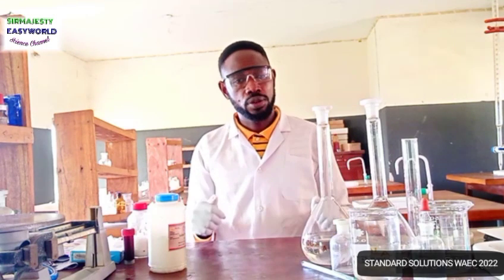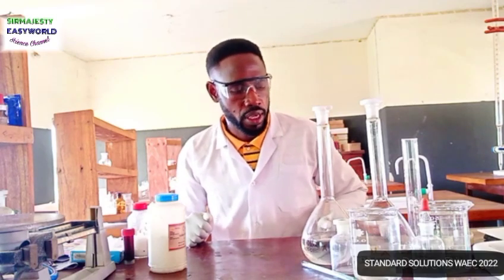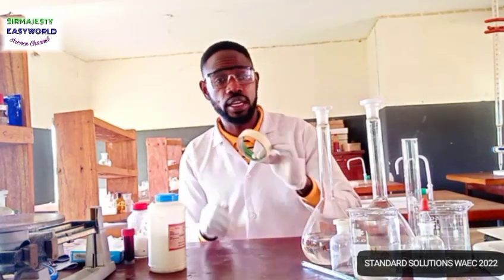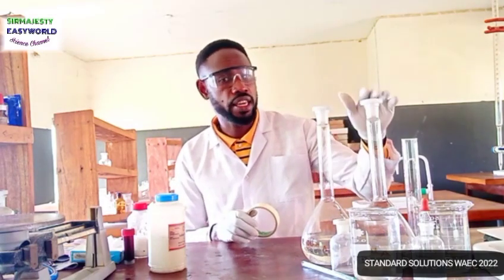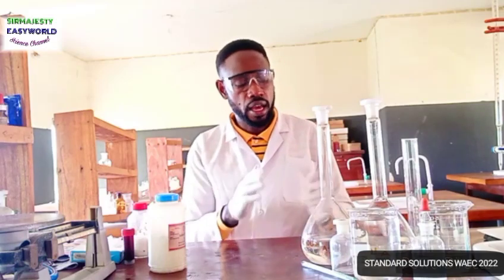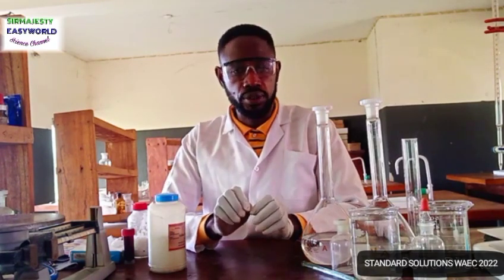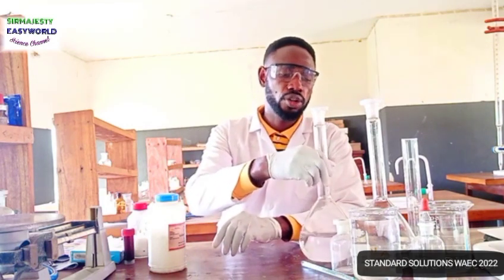Nice. So back to the preparation of the two standard solutions A and B. Lest I forget, you need also a masking tape or a label to distinguish between A and B to avoid confusing them, or you prepare them separately. Now, the steps involved for A is required for you to dissolve the iodine in potassium iodide solution. Then, first of all, what must you do? Remember, they say it's going to be contained in 1000 cm3, that's 1000 ml per solution.